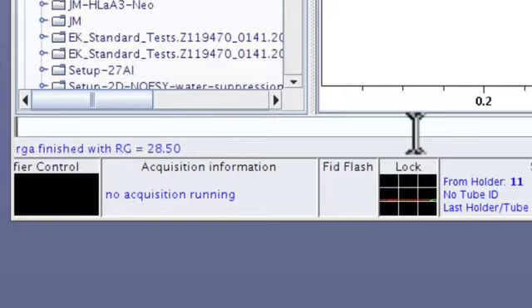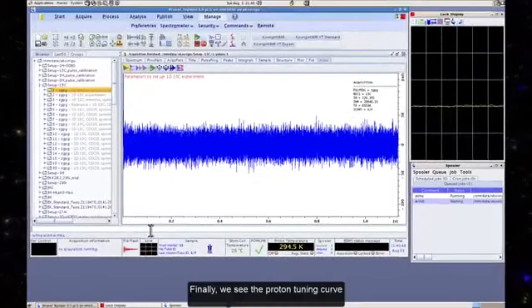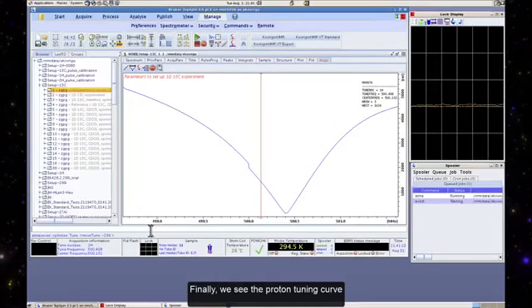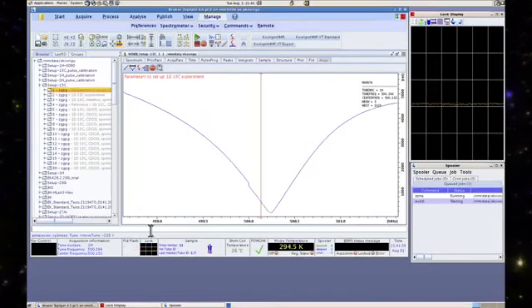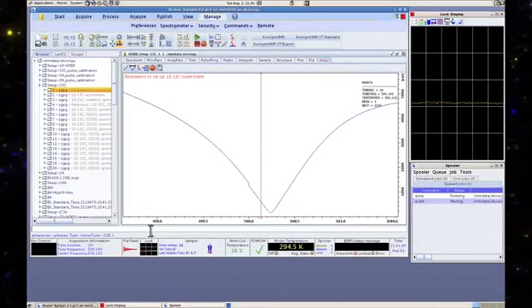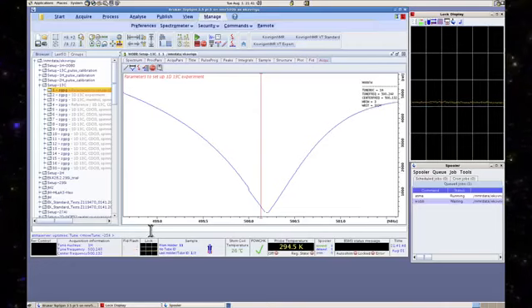3. The workstation, function, the user interface. It controls the console, processes the acquired data, and stores all experimental parameters and results. Location, typically located in a nearby control room. Components, a standard computer, often a Linux PC, running the TopSpin software suite.